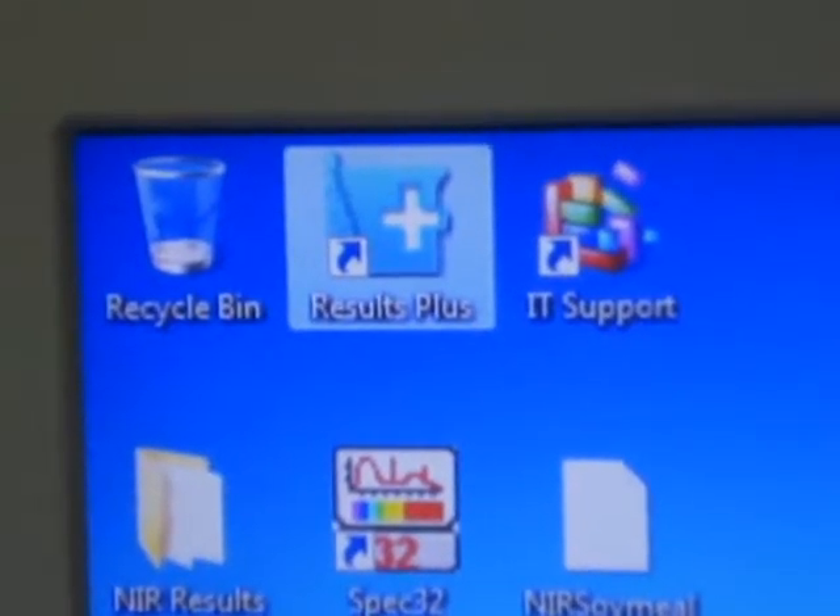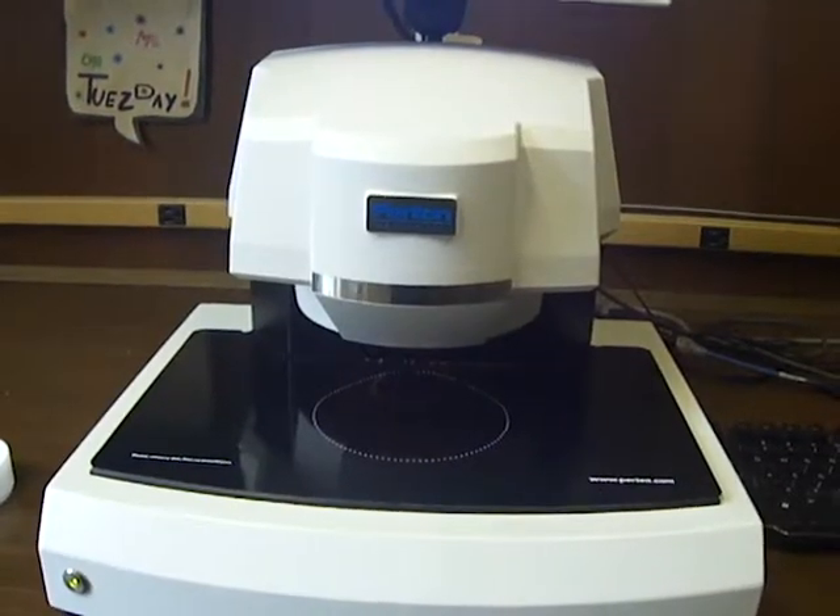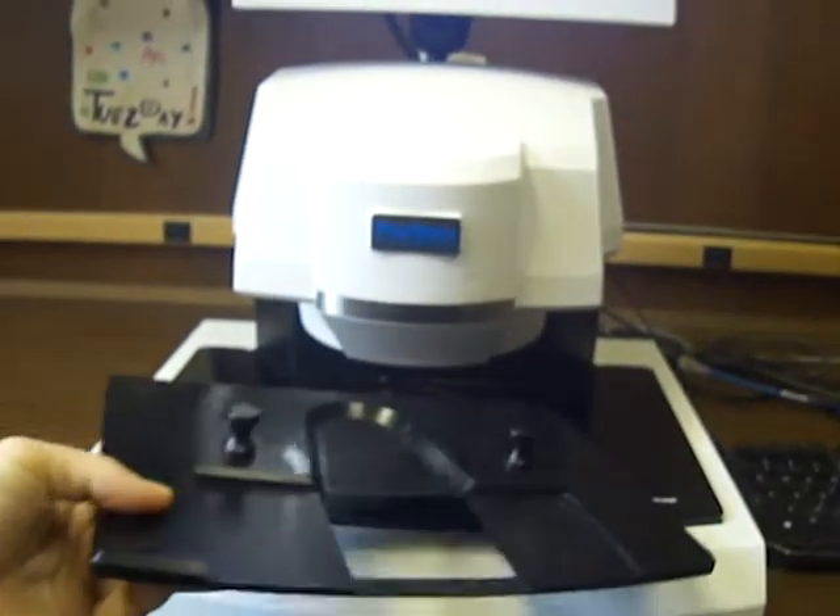The Results Plus program is used by this NIR machine to take readings, display, and store data. To calibrate the machine, place this square magnetic tray under the light and slide out the tray.